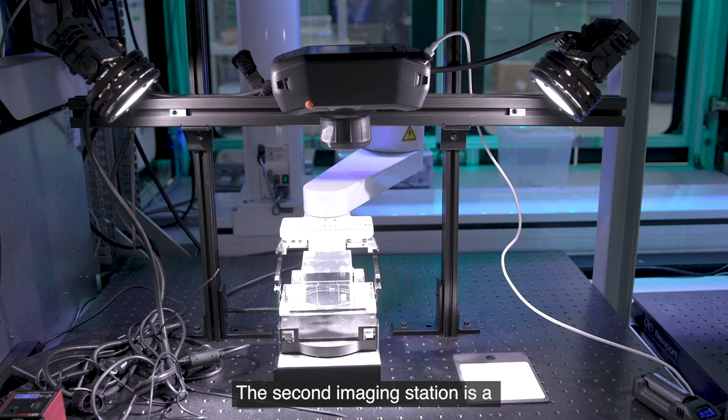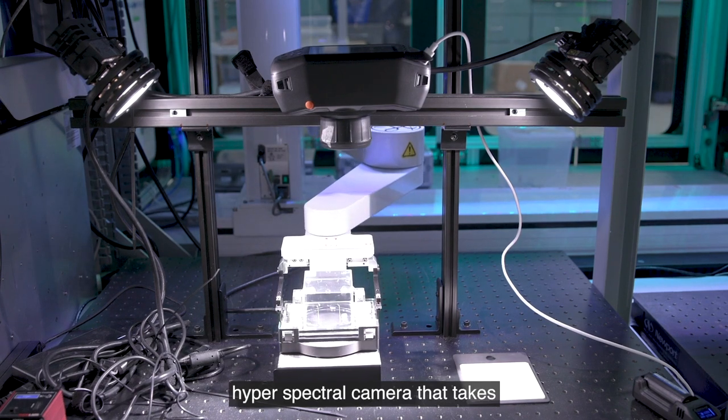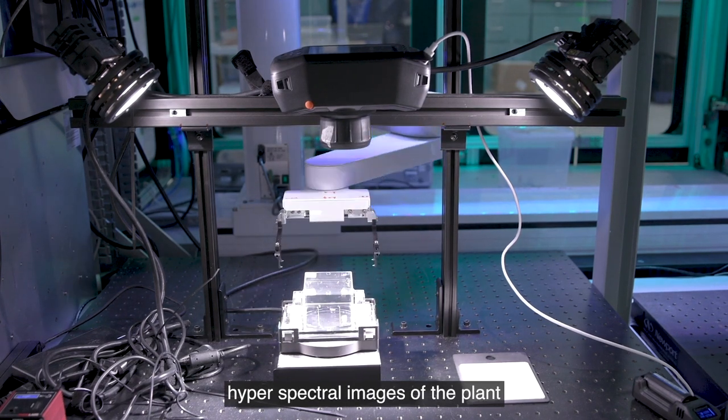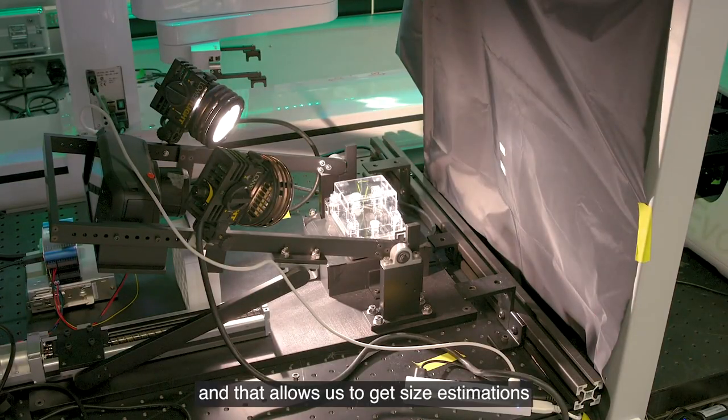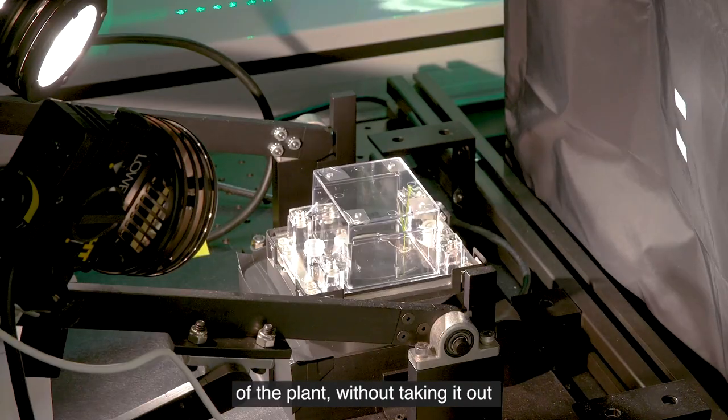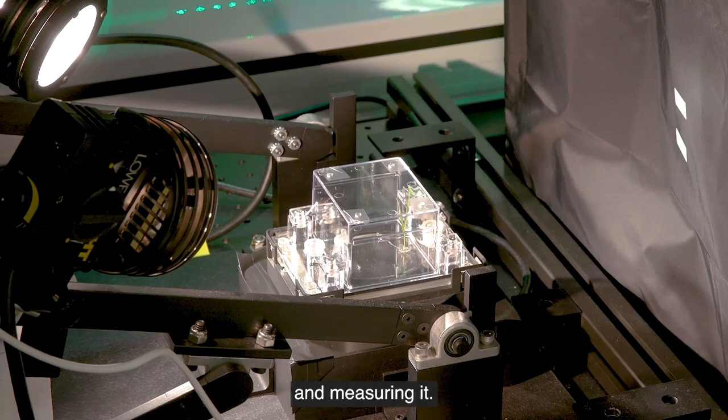The second imaging station is a hyperspectral camera that takes hyperspectral images of the plant from three different angles, and that allows us to get size estimations on the plant without taking it out and measuring it.